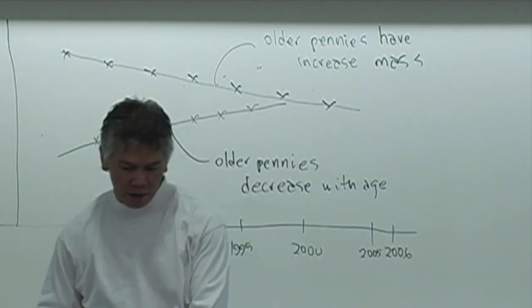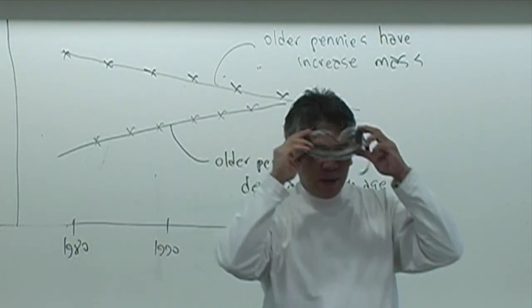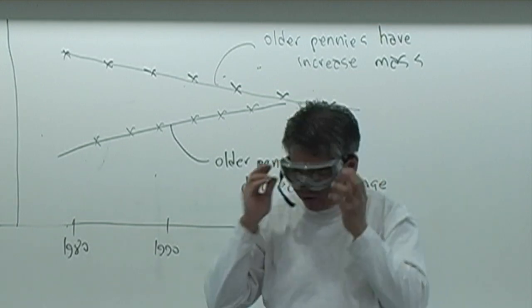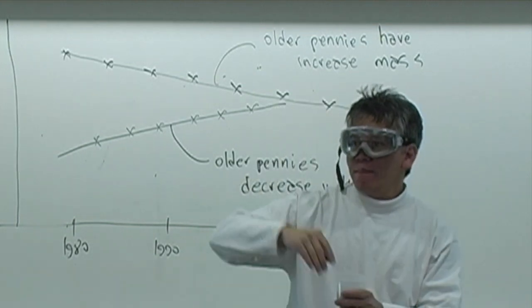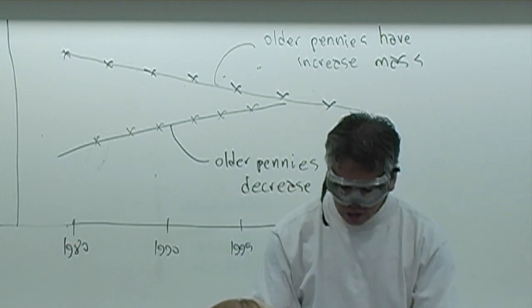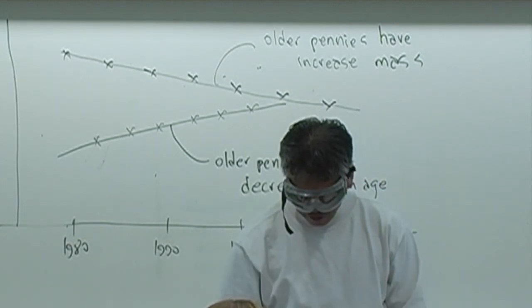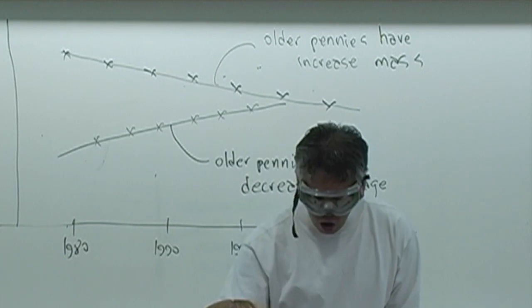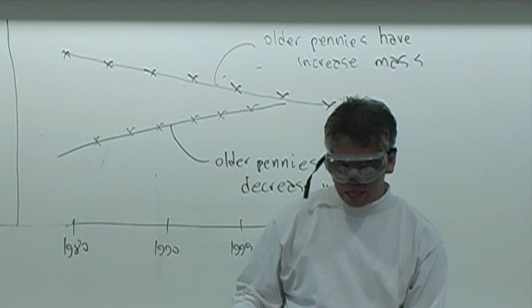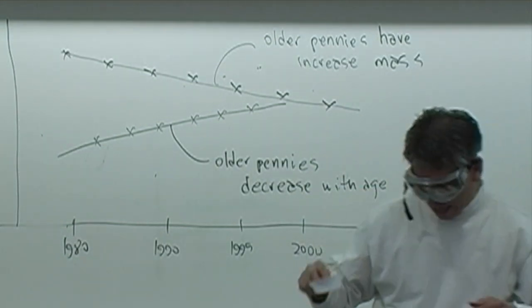We do the experiment. The experiment, of course, will require you to grab a handful of pennies. Grab a handful of pennies, and there are pennies in the back counter over there. What you want to do is use the balance, and you guys are going to use this for the first time. It'll generally be on, but make sure that it's on, and then there's a weighing boat in each balance.